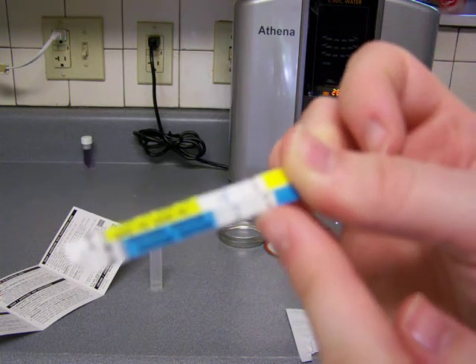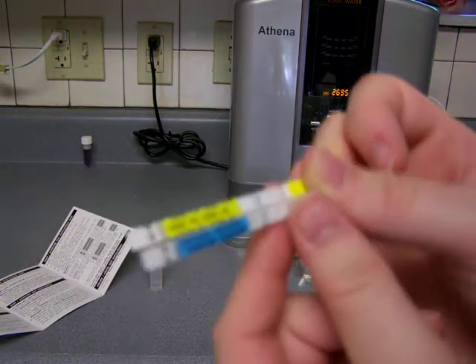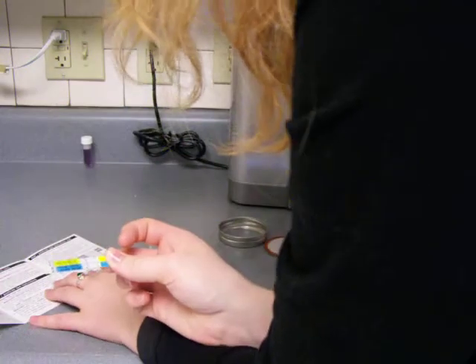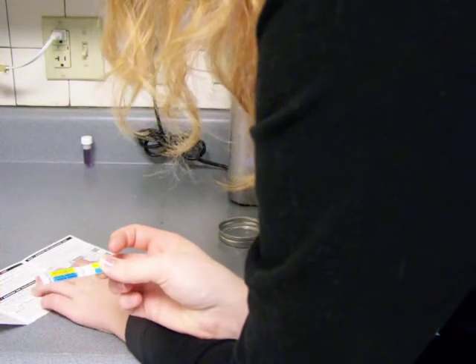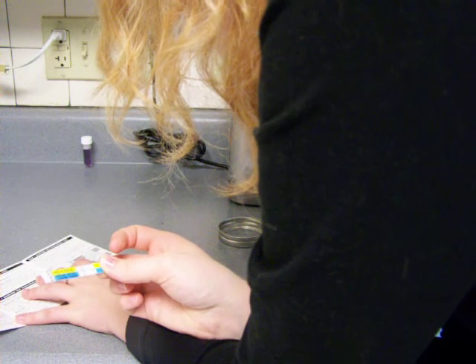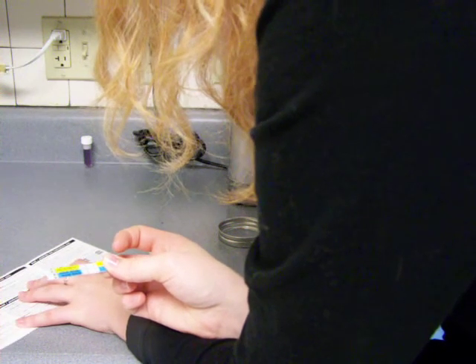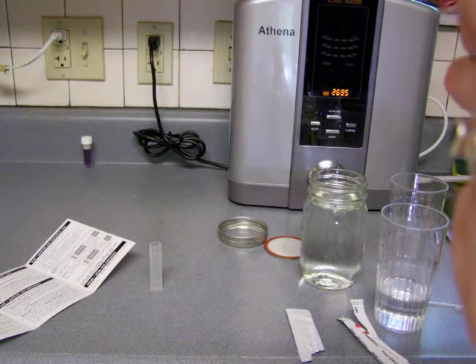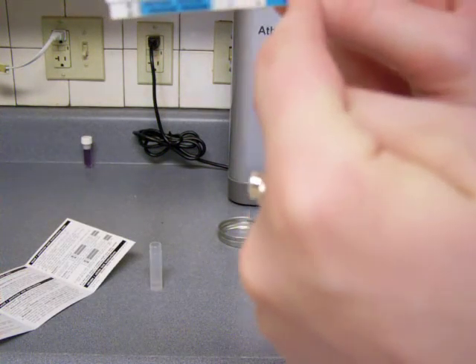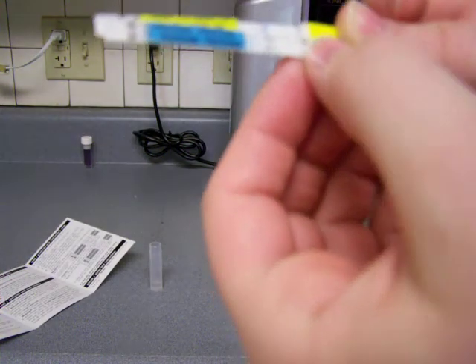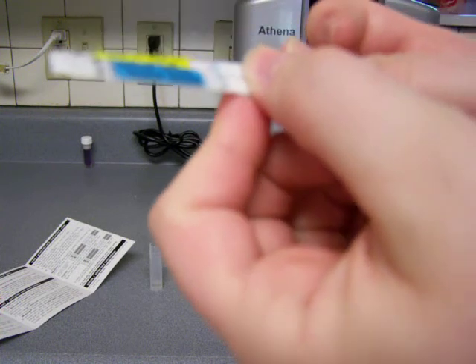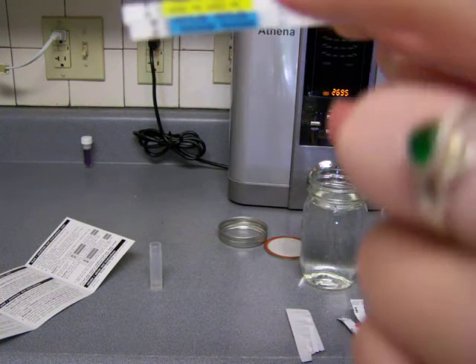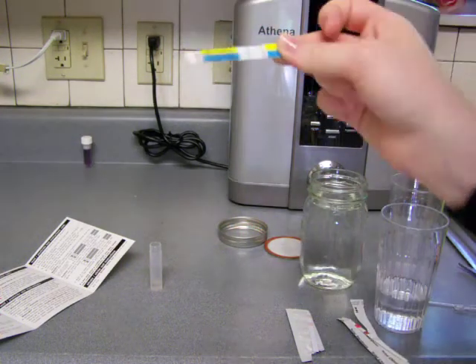The left one near the one is definitely dark. Now this one is a little light actually towards the two. It says it's negative if the left line next to the number one is darker than the right line. So in both of these cases, that's the case. And this blue test strip is for pesticides and this one's for lead. So it's negative for lead and pesticides. I'm just going to stick it back in there.